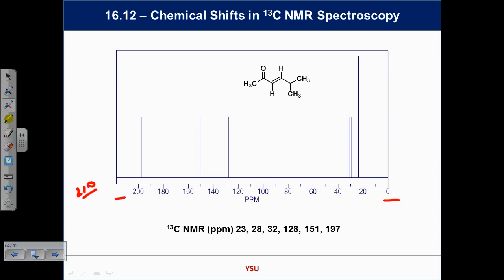You will start to see data in two forms. You'll be given the chart or the spectrum, and you'll be given this at the bottom. They are the same thing. Some people like to look at the graphs, and it's easy for them to comprehend what the answer is or what we're looking at. Some people prefer the linear data to get exact numbers. Both of them will be presented, so you've got them in front of you.